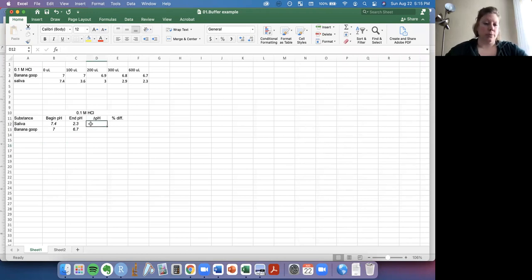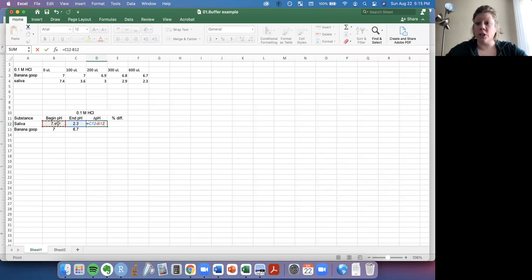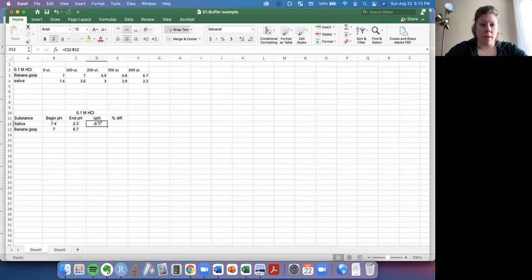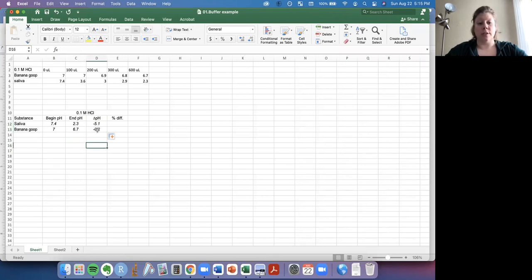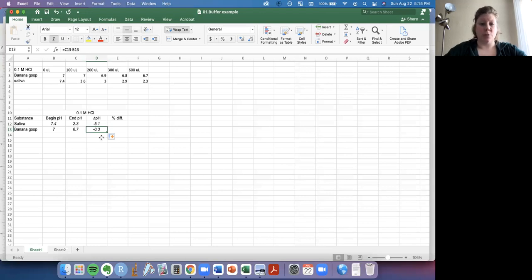So for the change in pH, we're going to say equals what it ended with minus what it started with. So how did it change? This one went down 5.1 pH points. And in Excel, you can just drag down and that'll do the same thing. We can even check up here, C13. This is 13. C13 minus B13. That gives us negative 0.3 pH points.